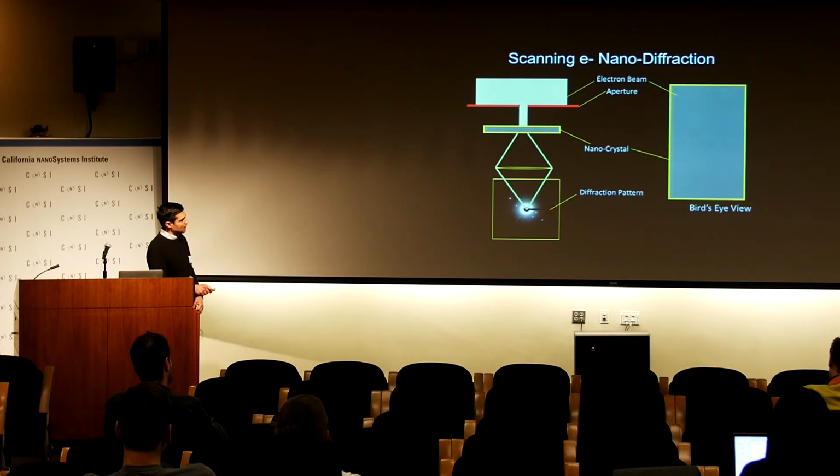And we can also use those in a second experiment, which is the point of this whole second bit, where we take a very, very small beam. The first electron beam was something like a micron in size. In this second experiment, we use a beam that's only 5 nanometers in size. So just to put this into perspective, one of those molecules that I showed you in that nice assembly was only about 3 nanometers long.